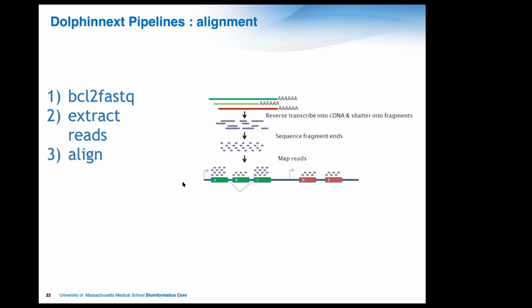Next, you're going to align these reads. Many aligners out there. There's STAR, there's HiSat, TopHat, which is older, but we had used for a while. But the idea is that within that FASTQ, we know what the cDNA region of the read is, so which part of the read was for the actual transcripts that we captured. And you can take those transcripts and map them to the reference. So you have a reference, A, B, C here might be 3 exons for gene A, D and E are 2 exons for gene B, and it can just take those fragments and map them to those regions so that you know which genes that DNA sequence corresponds to.